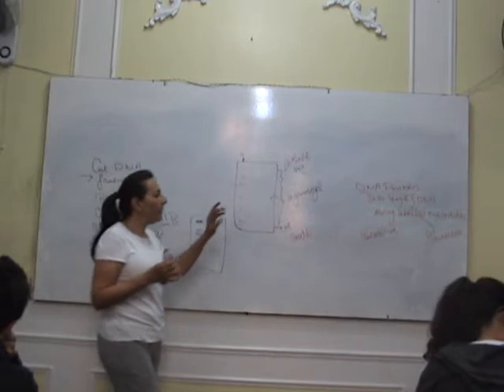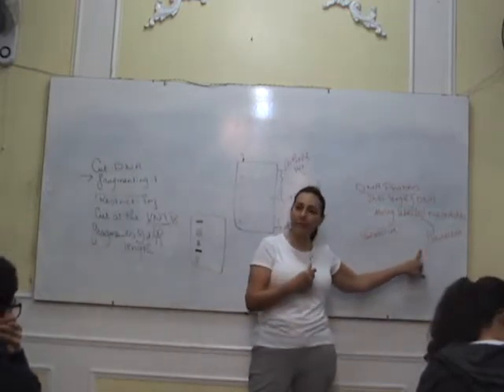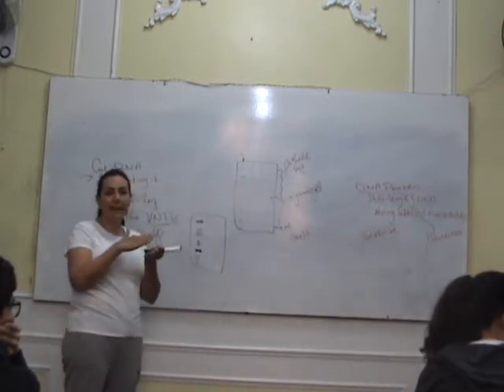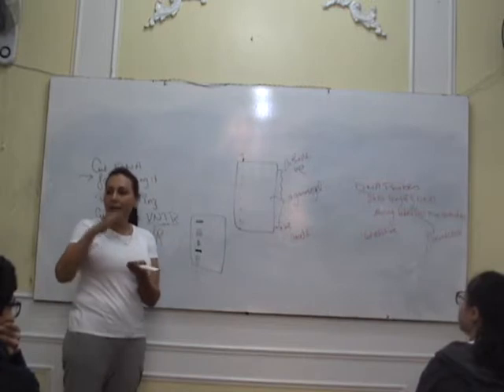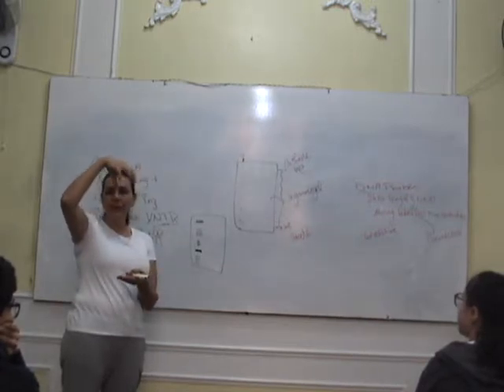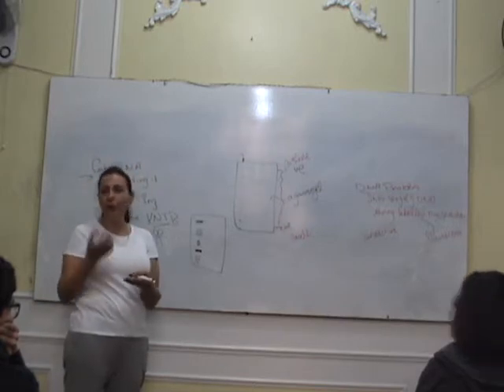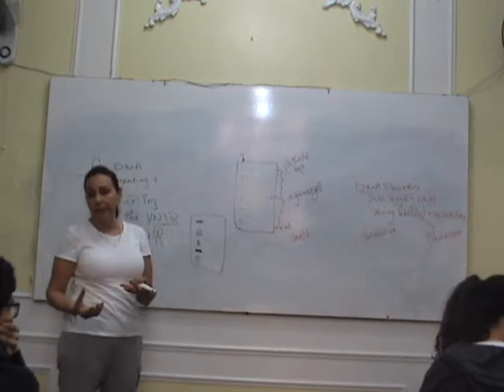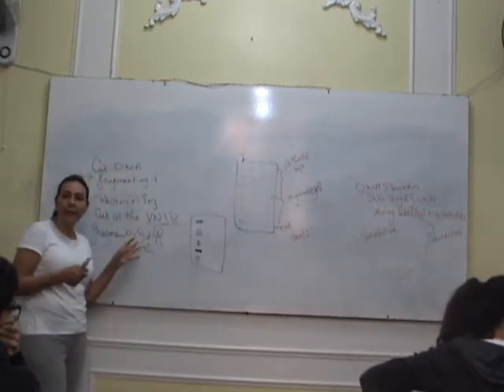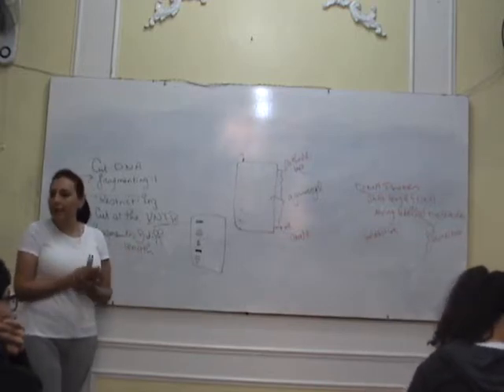Okay? If we are using nucleotides that are labeled with fluorescence, you go back to heating to separate the strands, and then I put the probes and I put the paper under ultraviolet light, and it's going to glow. The bands will start to glow, and that's how I see them. Okay? Yes, this is how to make the DNA visible on a gel electrophoresis.